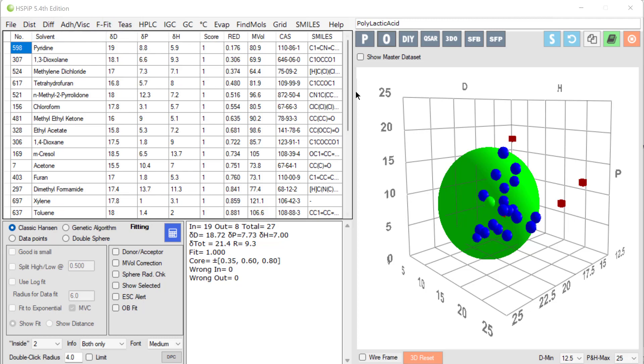We saw that polylactic acid could have its HSP measured at 18.7, 7.7, 7.0. Looking at this list of solvents, pyridine is a great solvent but too smelly, dioxalane is good but too volatile, and methylene dichloride is good but chlorinated, so we can't use it. How do we find good solvents or good solvent blends using rational techniques?